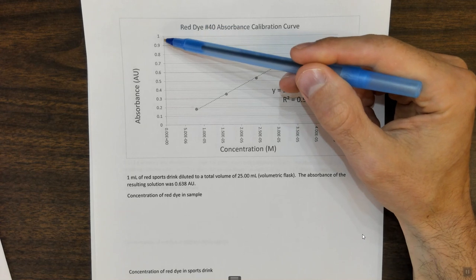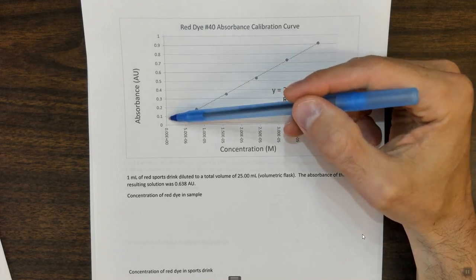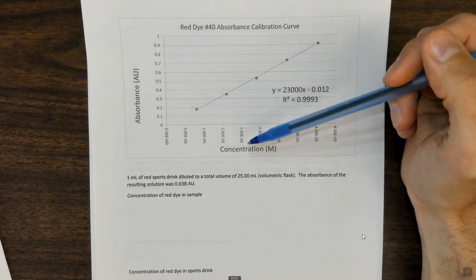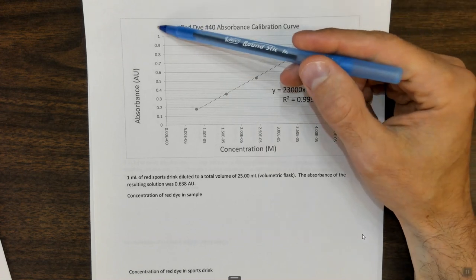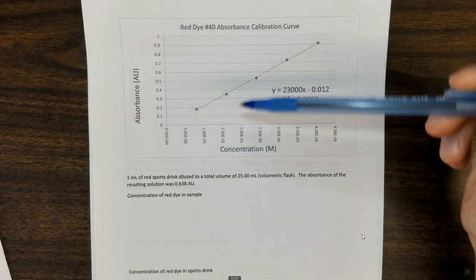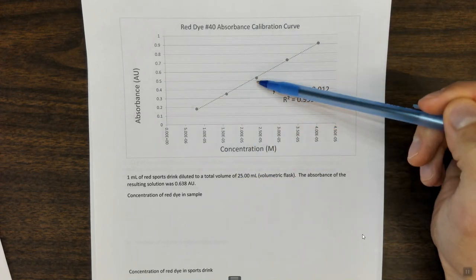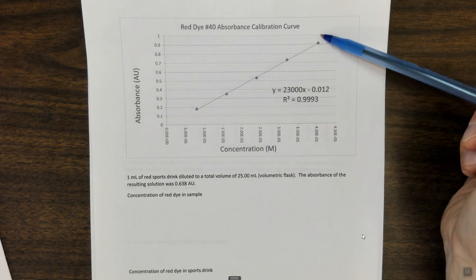But if you have an absorbance of 1 and you dilute it 10 times, it's going to become around 0.1. Then what you want to do is experimentally, and I'm not giving you exact details here, I'm just giving you a strategy of how to do this: you want to find something with an absorbance of around 1 by diluting by 10 times until you get an absorbance that is in the linear range, and then doing a calculation to figure out what would give you an absorbance of around 1. Make that around 1 solution.